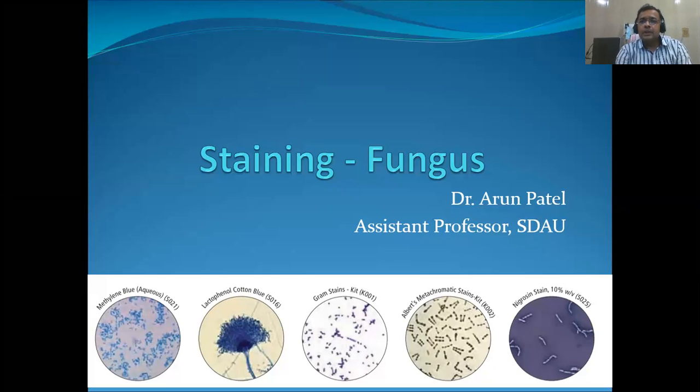We will continue with our previous class about the staining of microbes. In the earlier class, we discussed the staining of bacteria. Now in this class, we will discuss the important method of staining of fungi, because fungi are also important and require a different procedure for staining. In today's class, we will discuss the important staining method that is generally used for staining fungi.